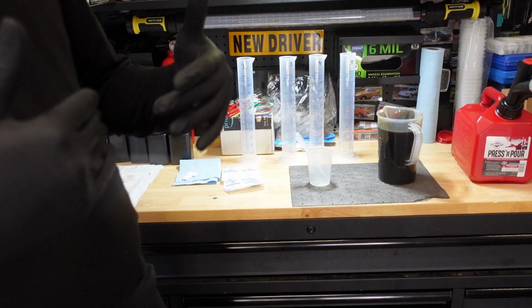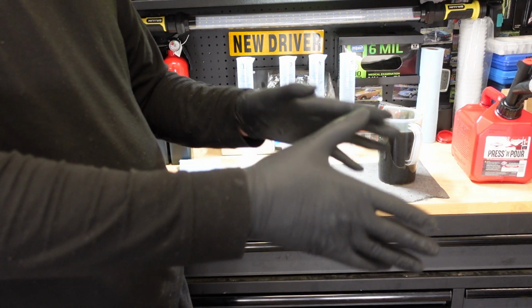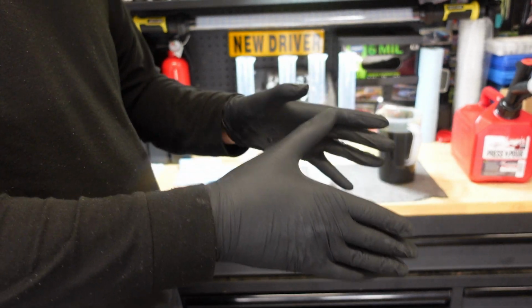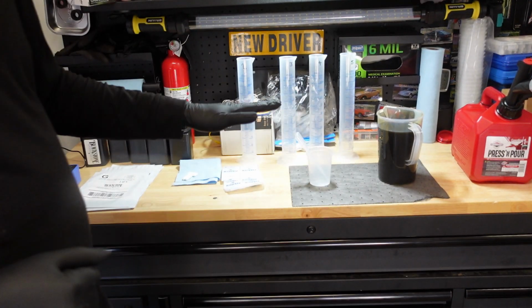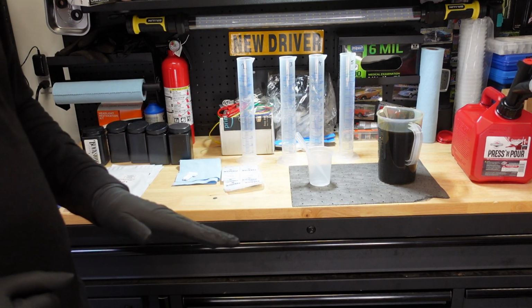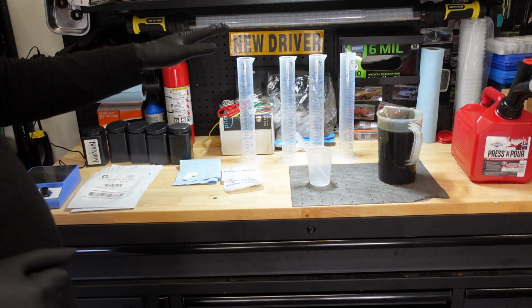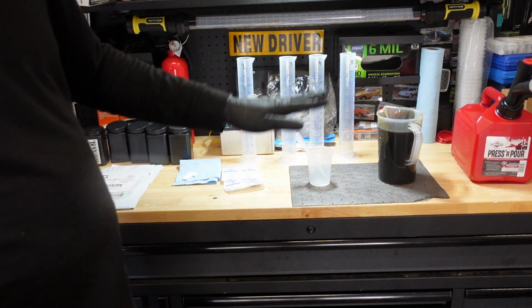So they're using sort of an indirect method, versus some other places that might use an actual direct method to measure the actual gasoline molecules present in a given volume. So how are we going to test this system to see just how accurate it is? Well, we're going to test the accuracy of the results that Blackstone Labs generated by a method called dilution or linearity.